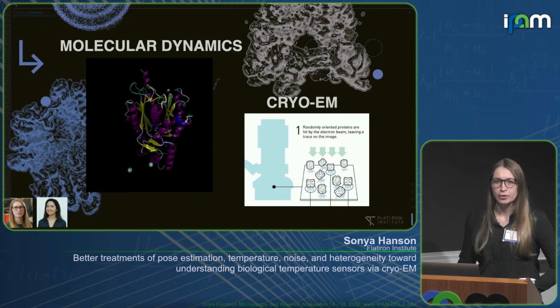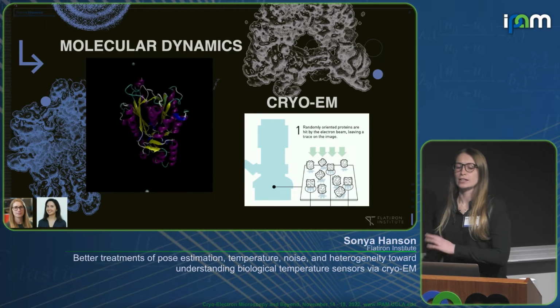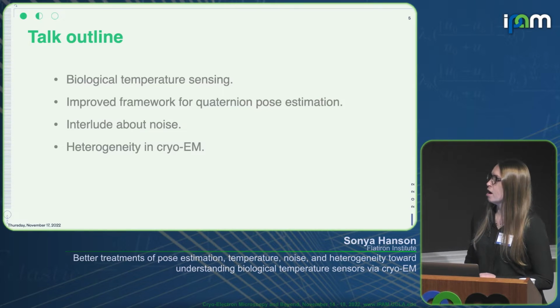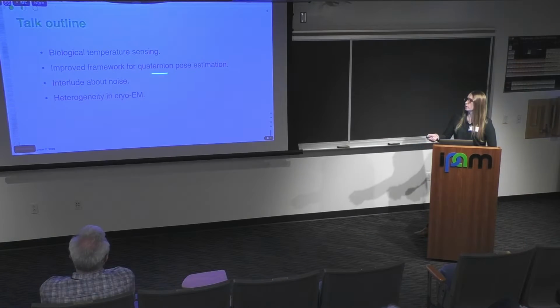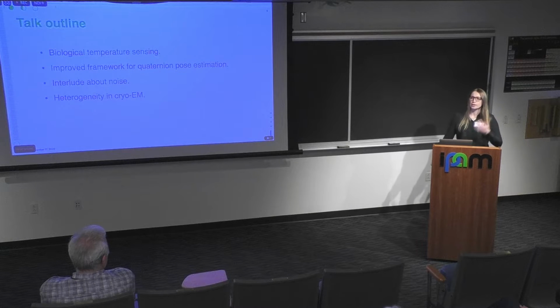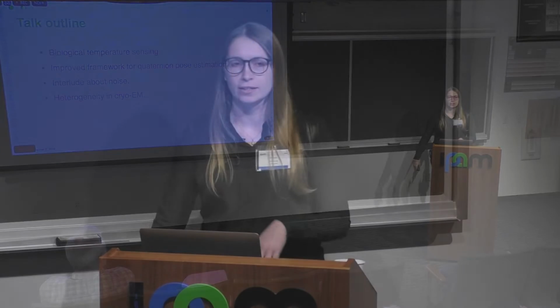In my particular case, I'm coming at it less from a method side and more from a biology-motivated side. So actually, I'm very interested in trying to understand biological temperature sensing. We've already seen a few people today, and yesterday and Monday, talk about the TRPV1 dataset as a representative data set from cryo-EM because it played such a key role in the resolution revolution. I'm here to tell you a bit more about what that protein actually does and why it's really, really cool.